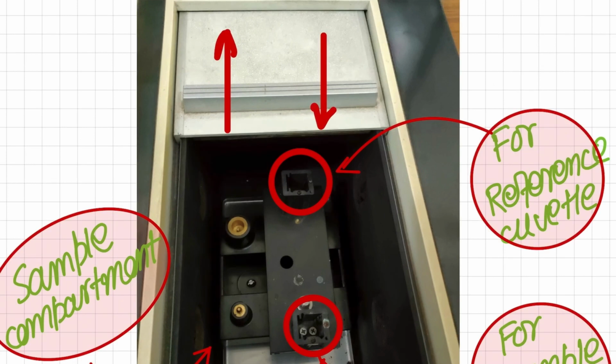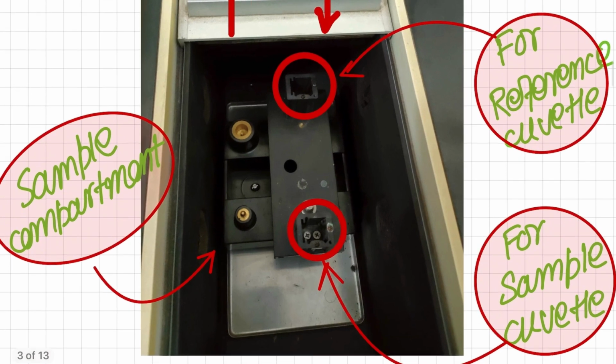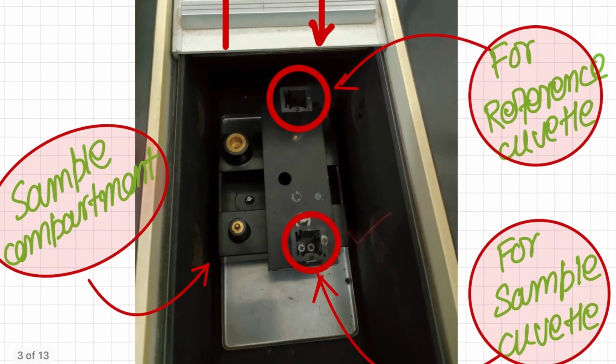Next we will place our reference and our sample in cuvettes, and then we will place these cuvettes inside the instrument. As this is a double beam spectrophotometer, there are two cuvettes that will be placed. The place which is away from your side is for the reference, whereas the place which is towards your side is the place for the sample. So here we will place the reference cuvette, and here we will place the sample cuvette.